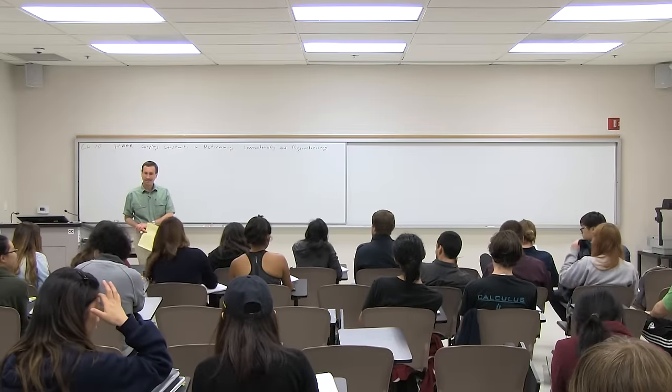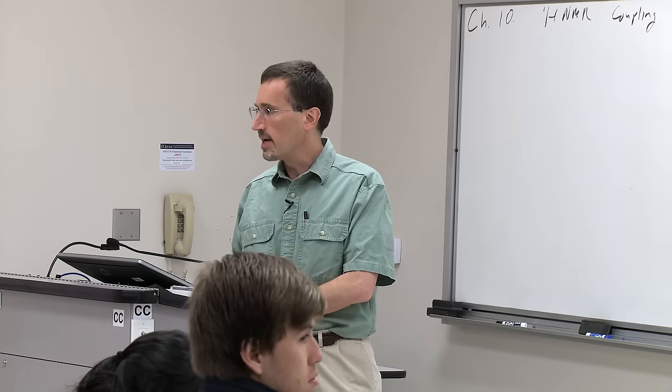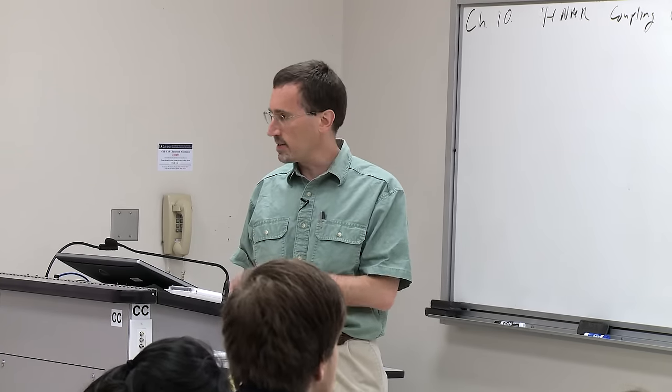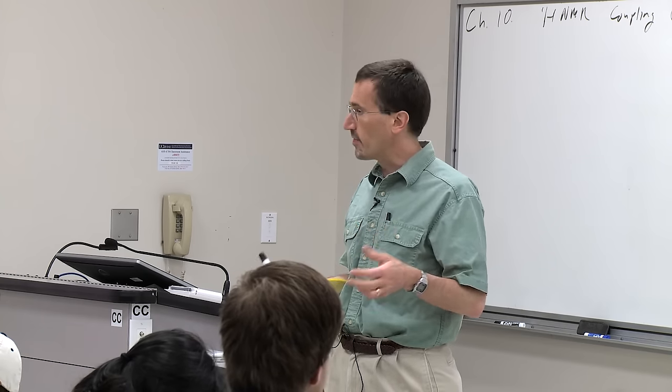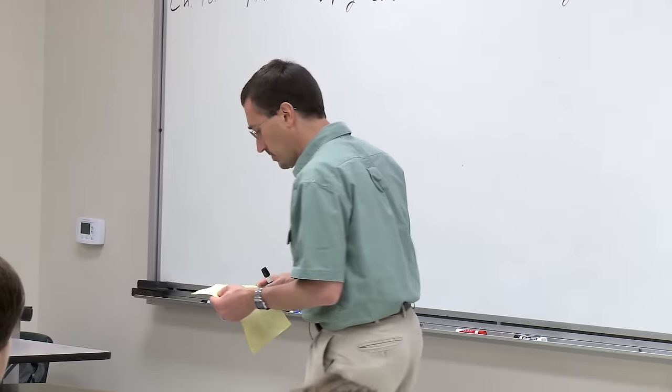Good morning. So I want to talk about coupling in NMR spectroscopy and proton NMR spectroscopy. And specifically, what I think we'll do in today's lecture is use coupling constants, get a better understanding of spin-spin coupling, and use coupling constants to help determine stereochemistry and regiochemistry of a couple of compounds. In other words, get an idea of how coupling constants can help us in better understanding molecular structure.